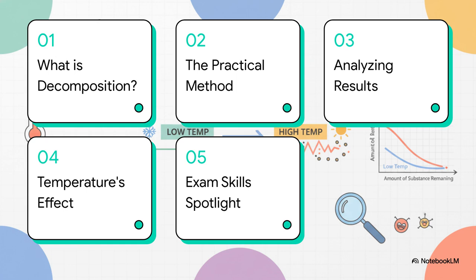So, here's our game plan. First, we'll get a solid handle on what decomposition actually is. Then, we're going to walk through the milk practical step by step. After that, we'll look at how to analyze your results and draw a proper conclusion. We'll also cover the science behind it all. And finally, we'll shine a spotlight on the exact skills that examiners are looking for.